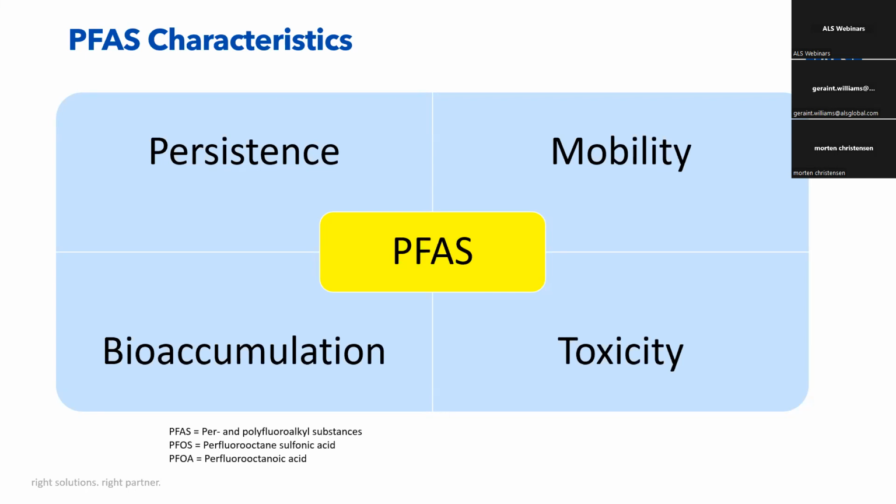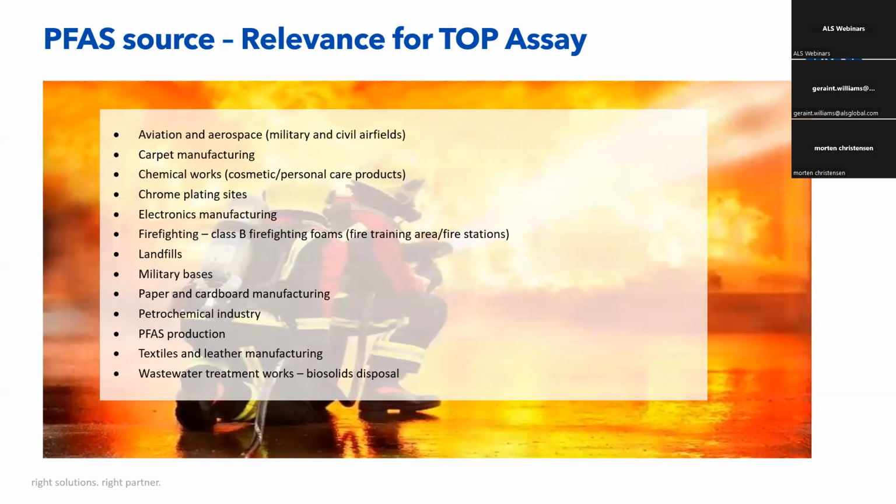I would say, as a word of caution, not all PFAS are the same. We're starting to look at some of the fluorotelomer alcohols, the FTOHs. They've got different physical chemical characteristics. They tend to be more neutral, more volatile. So they would be quite different to the more studied PFOS and the PFOAs of the world. So just kind of an opening slide.